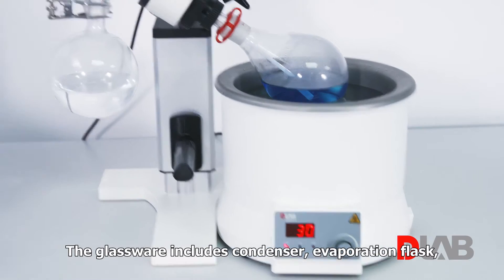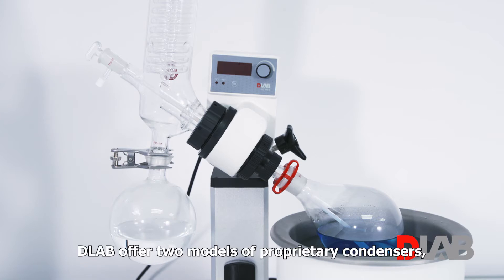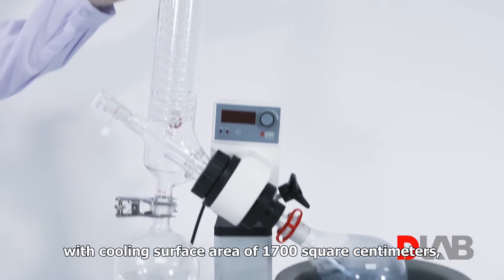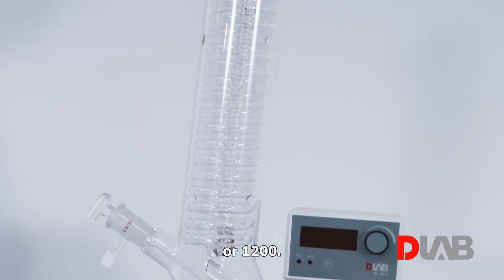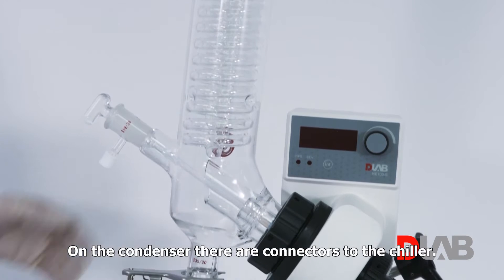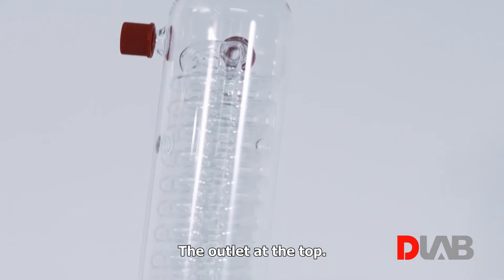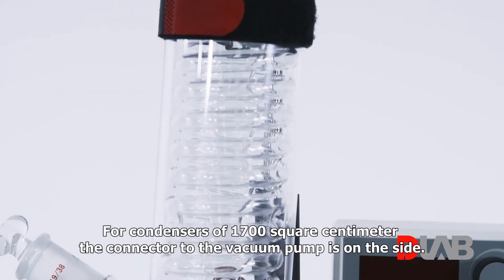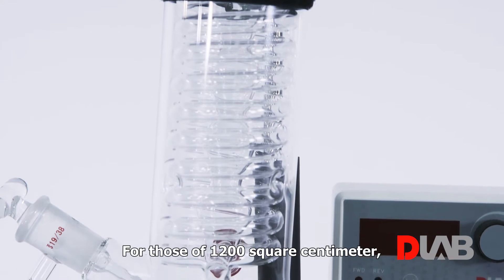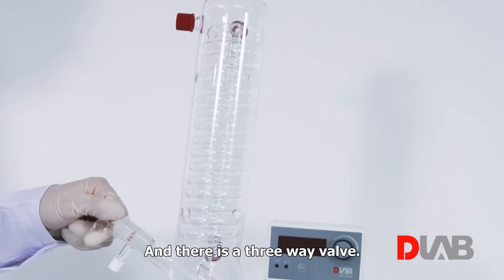The glassware includes the condenser, evaporation flask, and receiving flask. D-Lab offers two models of proprietary condensers with a cooling surface area of 1700 square centimeters or 1200. On the condenser, there are connectors to the chiller — the inlet at the bottom and the outlet at the top. For the 1700 cm² condenser, the connector to the vacuum pump is on the side; for the 1200, it is on the top. There is also a three-way valve.